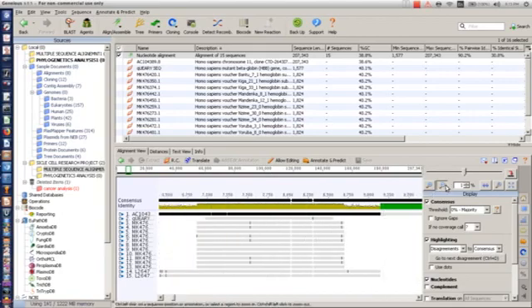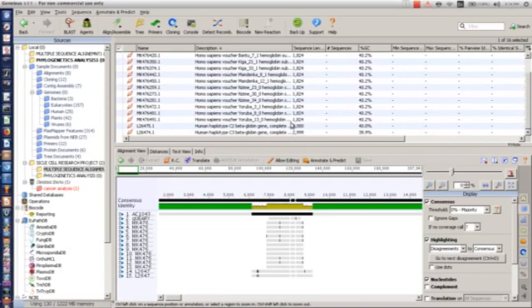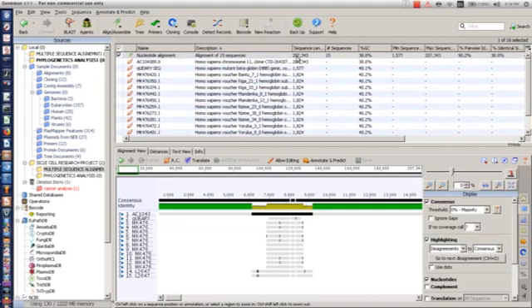Now as you can see, we have a lot of long sequences. The reason why all this is very long is because of this actual sequence. Remember, we have our query sequence here, and our query sequence is number 2, while this sequence here is like 207,346. So that is why it's very long this way, but every other sequence is very short, about 1,557 here, 1,000-something, and then we have 3,000 here or 2,000 here. So this sequence is actually long, and that is why we have a very long extent of alignment here.